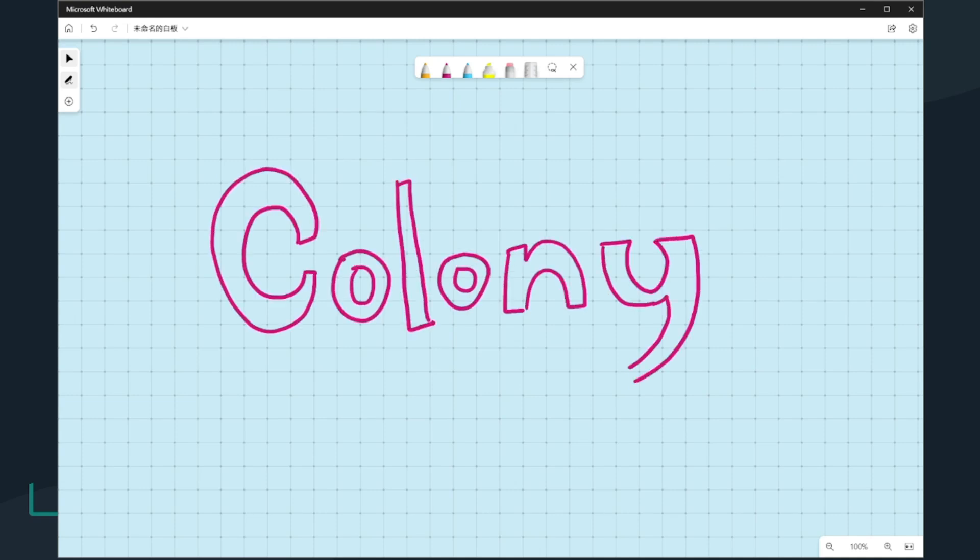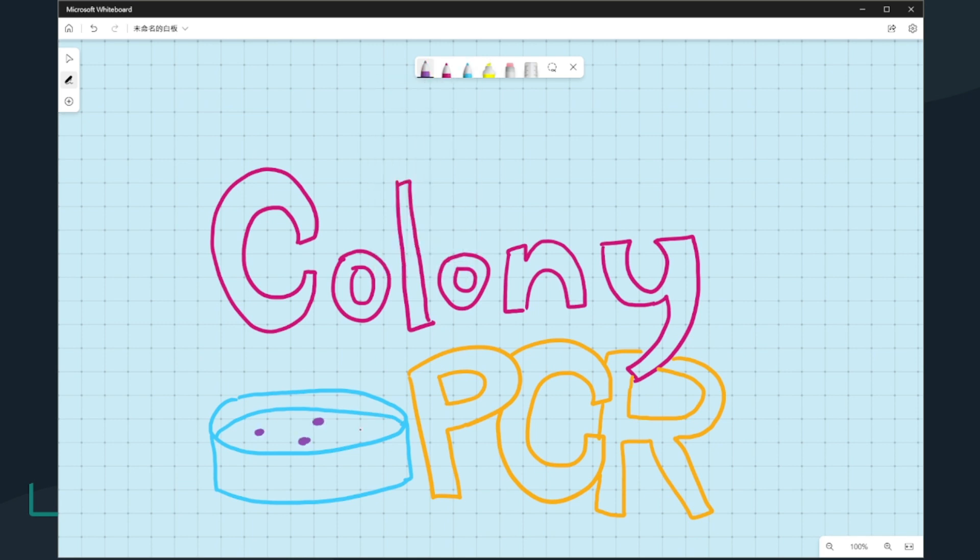Hello everyone, welcome to today's video. In today's video, I'm going to demonstrate how to do a colony PCR, which is using bacteria colony directly for PCR process. A quite convenient and easy way to do with bacteria.